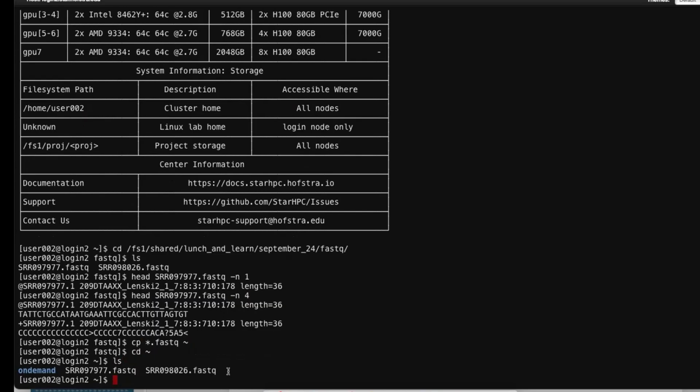There are lots of specialized tools for working with sequencing files, but I'm going to teach you a general bash tool that I think might be useful for working with any kind of text data that you might have. To start to explore these files, we can search for specific strings we might be interested in. Maybe we want to know, where does ACGT occur in a file?